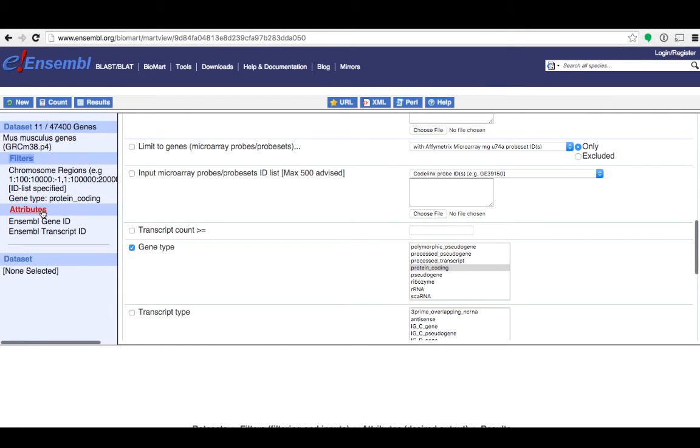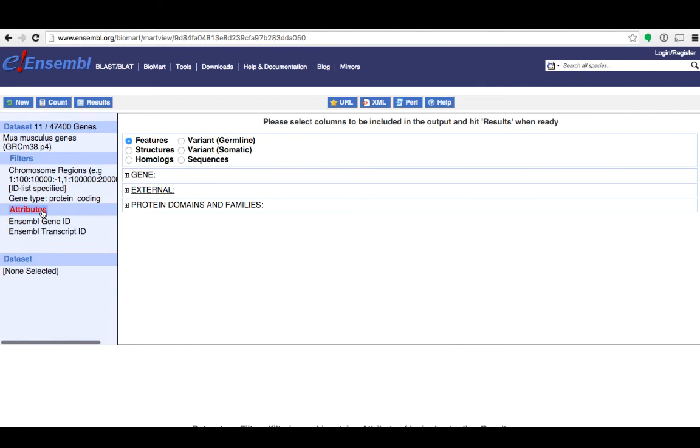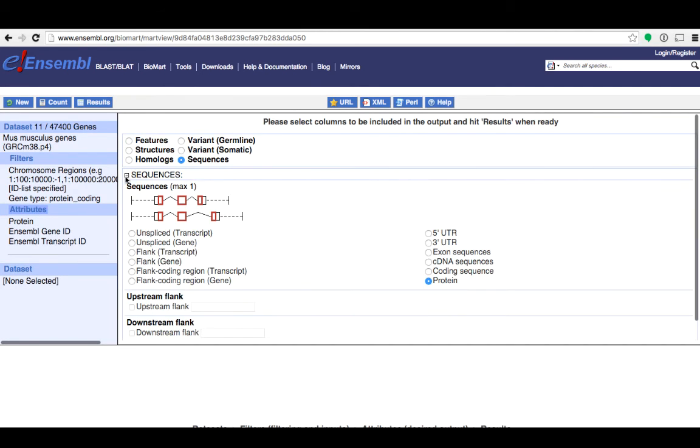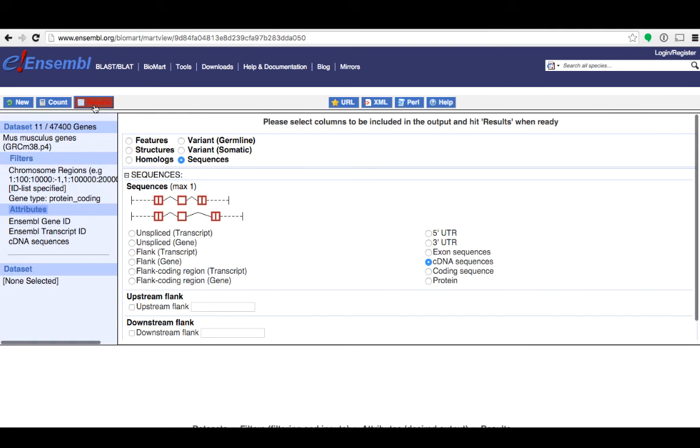I'm happy with my filters now so I'm going to move on to attributes. I'll select sequences here on the right. Expand the sequences menu and then choose cDNA. Now I'm ready to click results.